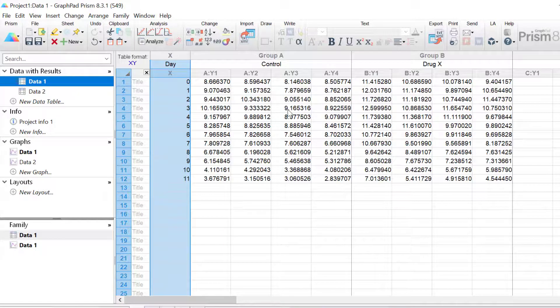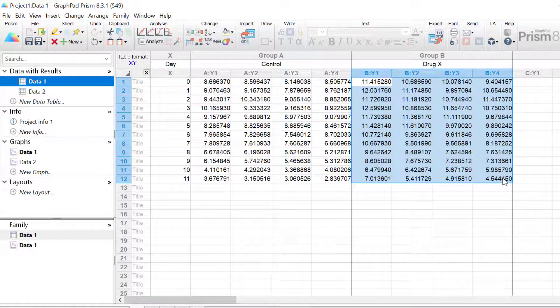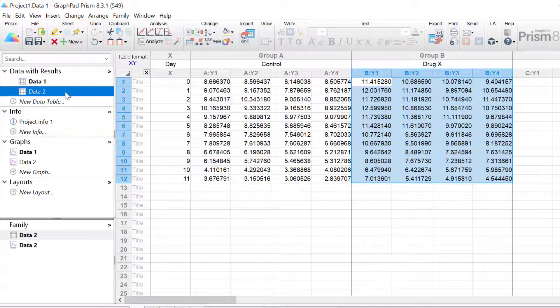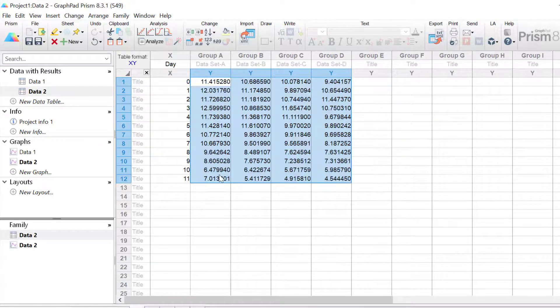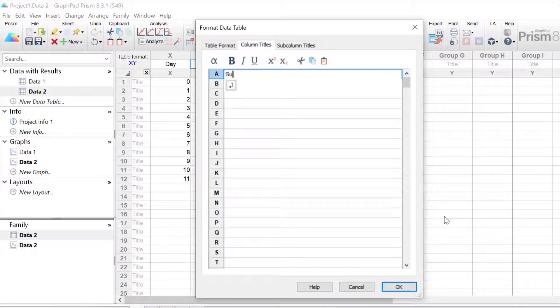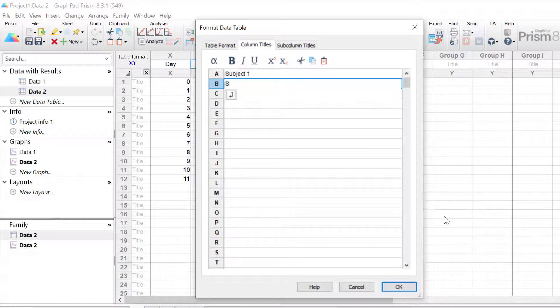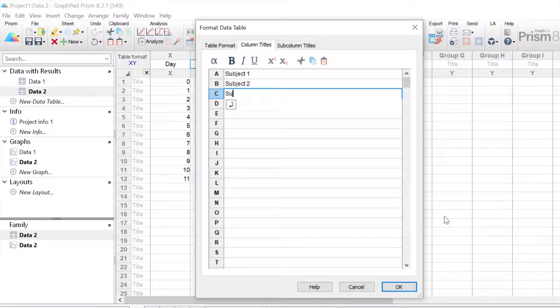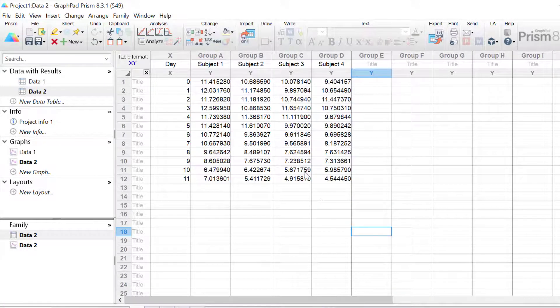Next I'm going to go back to the original data sheet and select to copy the replicate data for drug X only, then copy this into the Y columns in the new data sheet. I want to give my replicates different titles, so I'll double click on the title cell of the Y columns to open up the format data table window and enter a title for each column — subject1, subject2, subject3, and subject4 — then click OK. Now we have our data table set up.